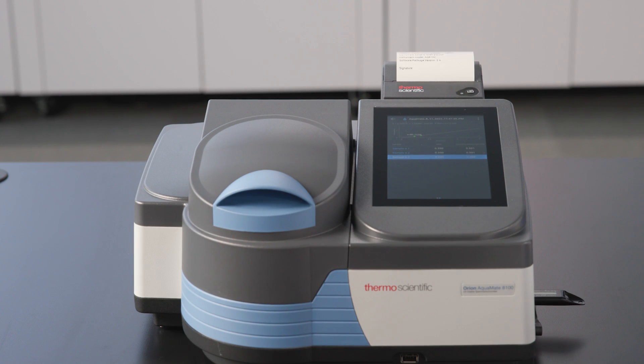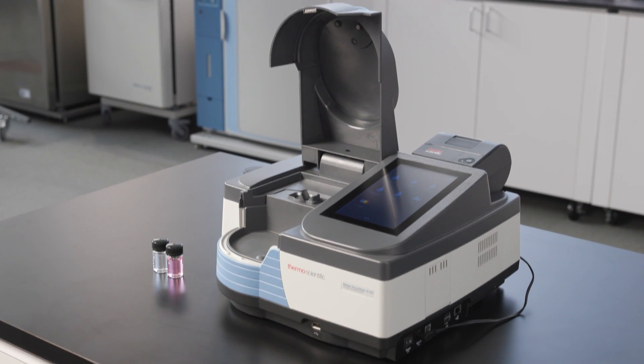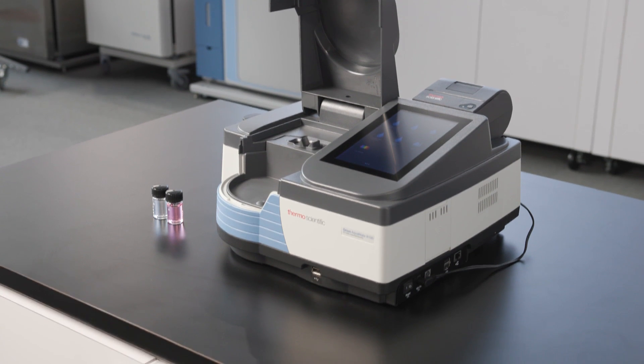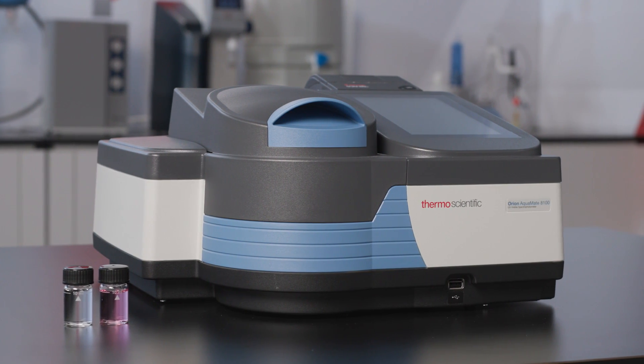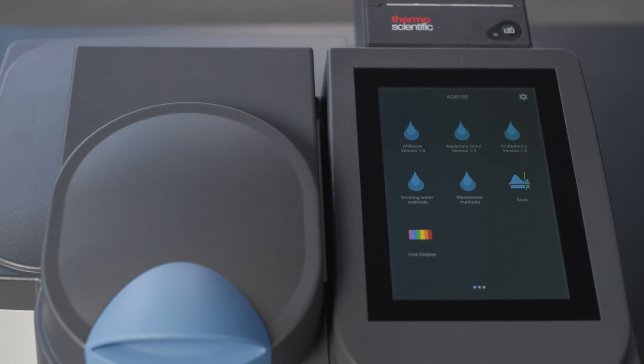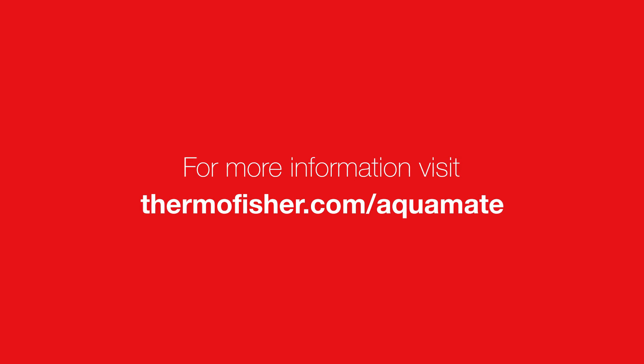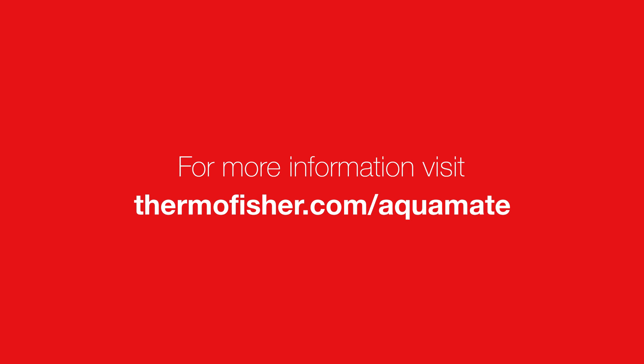As you can see, the Aquamate spectrophotometer line is an intuitively designed and flexible instrument. Whether our primary focus is on water quality, food and beverage quality control, or general analysis, Aquamate spectrophotometers are a valuable addition to any laboratory. I hope you found this demonstration video informative. For more information, visit us at thermofisher.com/aquamate.